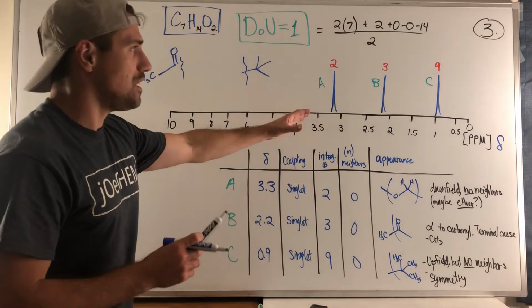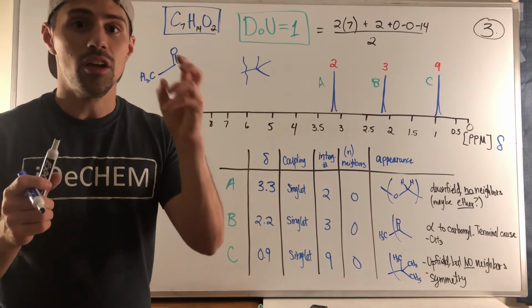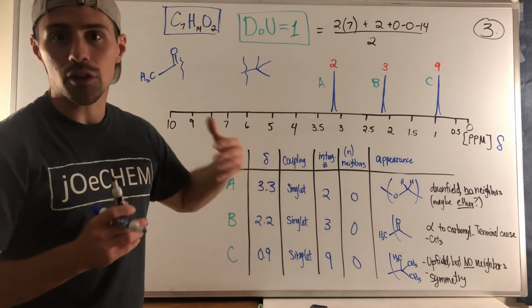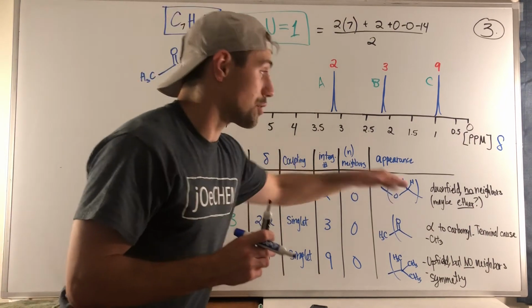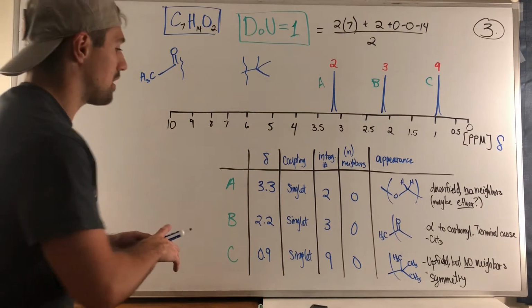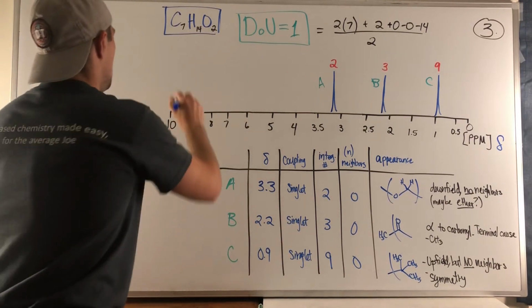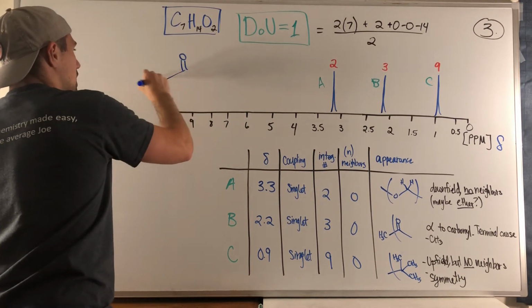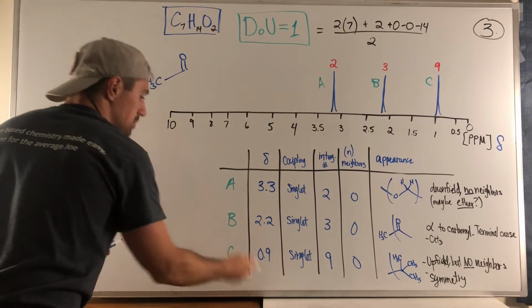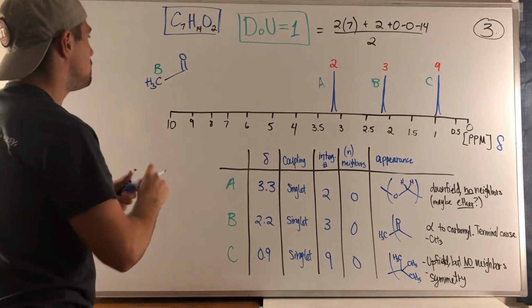And we're pretty downfield. If you look at your chemical shift table, in the previous example we had that carbon wedge between the 2 carbonyls. But very indicatively, if you're in the low 3s, mid-3s, you are in ether country, okay? So no neighbors, and an ether. Now think about this, piecing together what we've figured out. I feel very good about this, right? This to me is saying, this is peak B right here, okay? Obviously no peak for the carbonyl carbon.